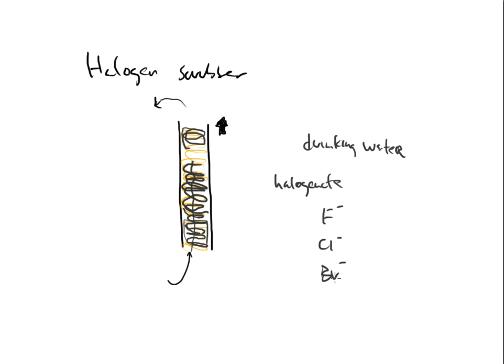So that halogen scrubber hopefully would last a little bit longer because I'm injecting cleaner samples maybe in the beginning. And if I can inject clean samples in the beginning that has very minimal amount of halogen, then all of a sudden this is a better story and a better scenario for me. I don't have to replace that scrubber as much.